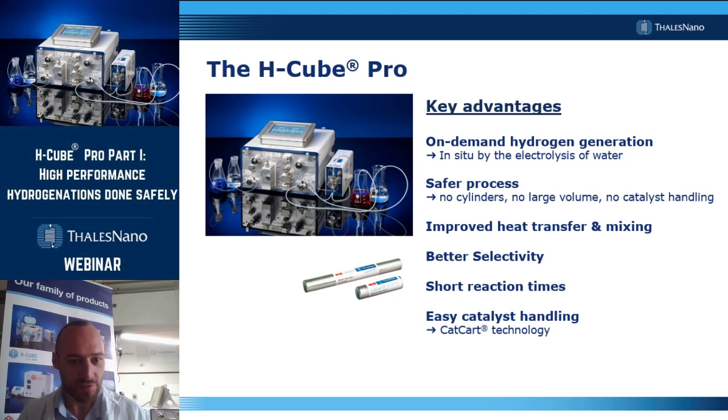Eventually, as I just said, there's no catalyst handling, as the catalyst is sealed into those cartridges you can see here, two of them. The catalyst cannot leave those cartridges during the reaction. That means you don't have any work-up at the end of the reaction. You don't need to filter the catalyst.